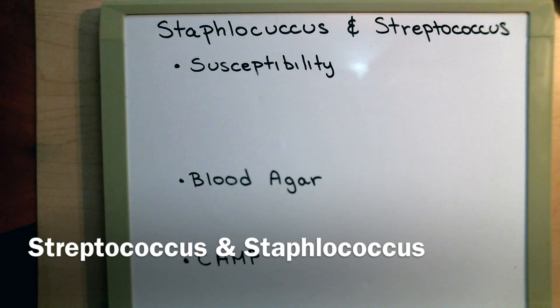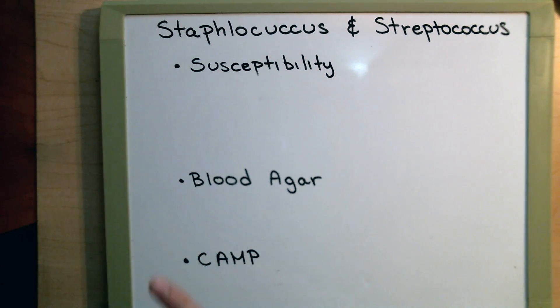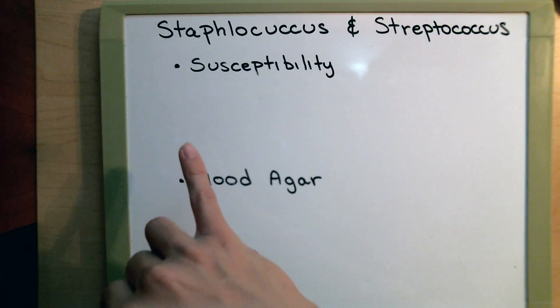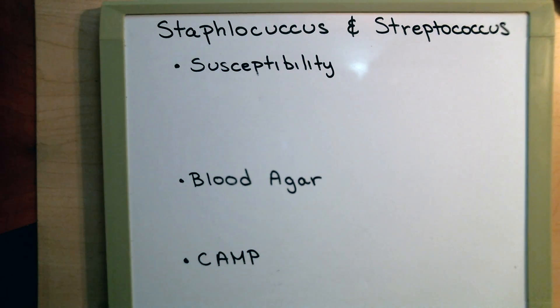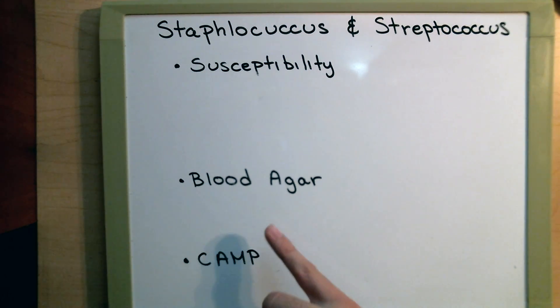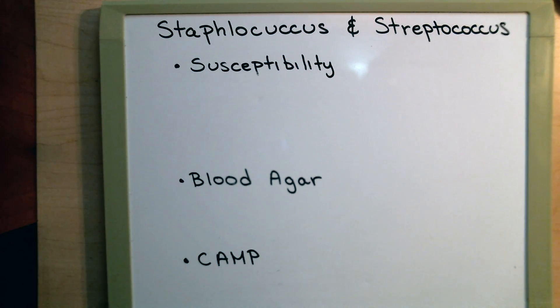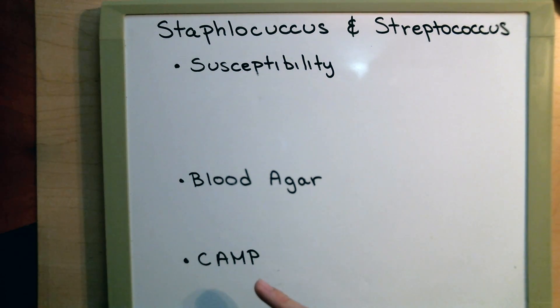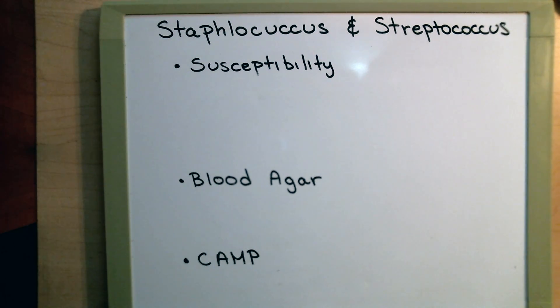Hi everyone. In this video we're going to go over staphylococcus and streptococcus. We're going to be looking at three different tests: your susceptibility tests where we're looking at three different antibiotics, blood agar plate where we're going to look at different types of hemolysis, and the last one is our CAMP plate which looks for synergistic effects between two different types of bacteria. With that said, let's get started.